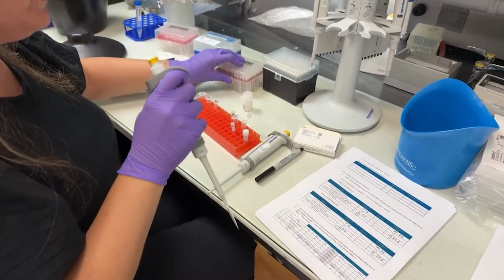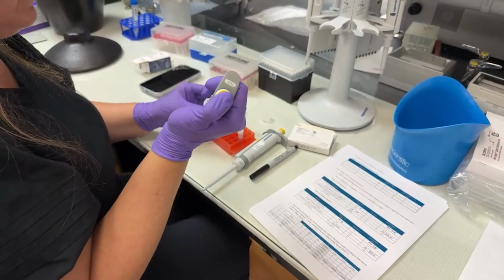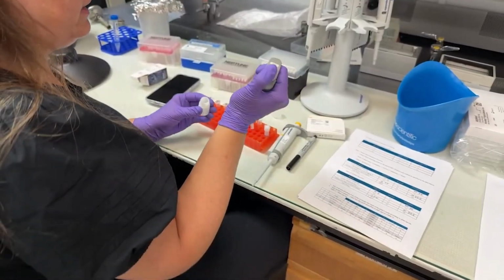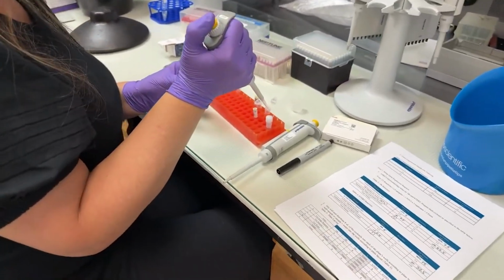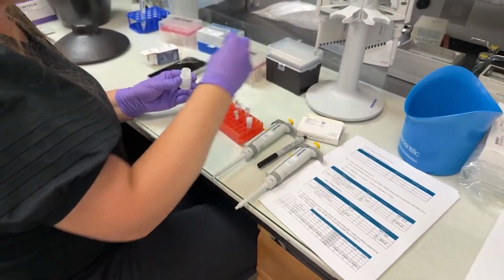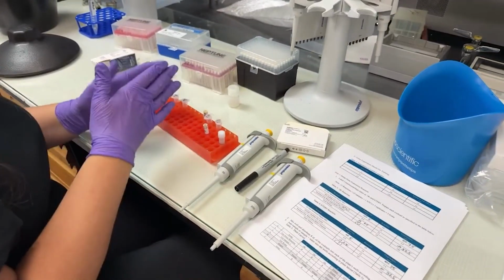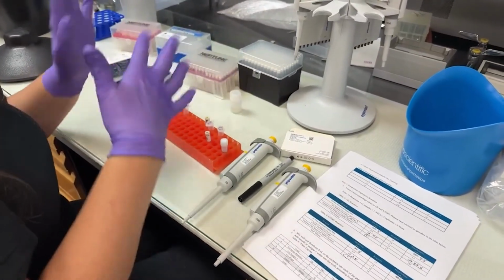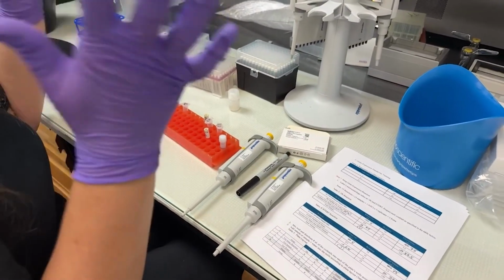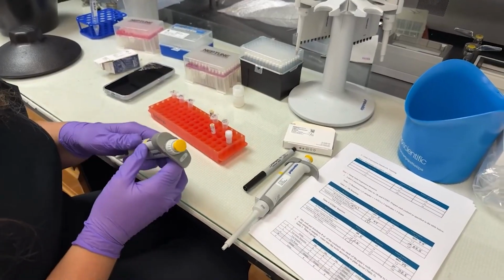So we had some key points we talked about for best practices, and one of them was being efficient and clean. Some of the things you're going to notice while I'm working is that when I'm not using a tube, it stays closed. That is important because if I were to take my tips and wave them around, I can have those magical DNA particles, RNA particles, go who knows where, and we don't want that. So everything stays closed when you're not working with it.